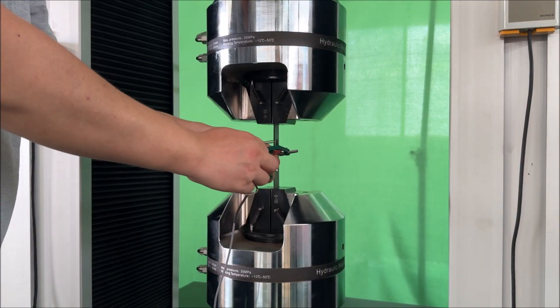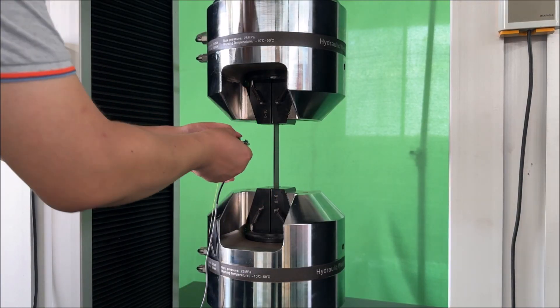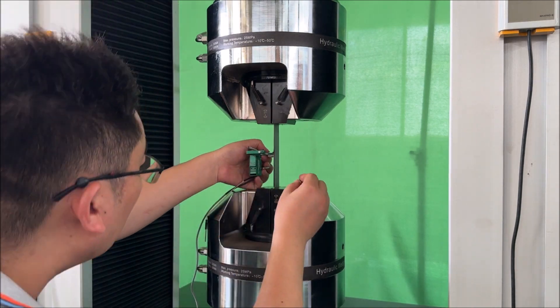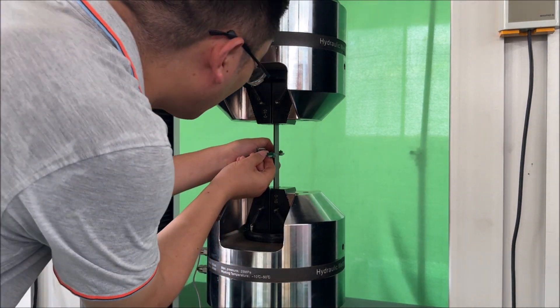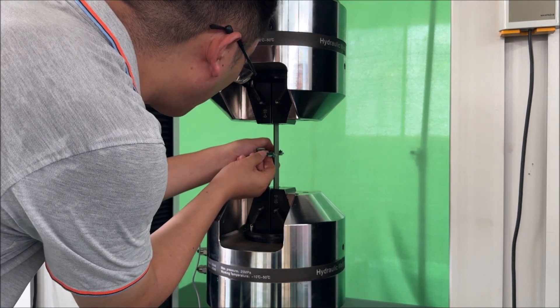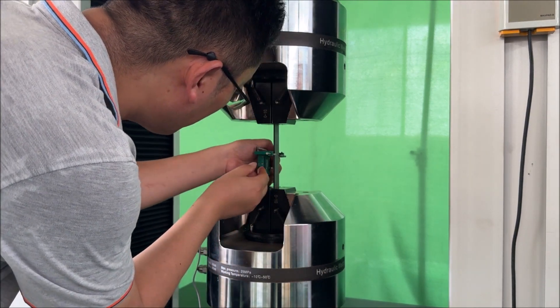Now we can perform a test on a tensile specimen using both the clip-on extensometer and the transverse extensometers.